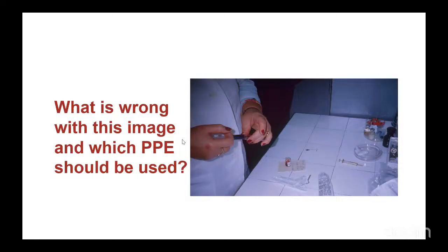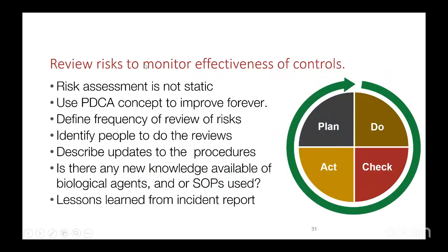Okay. The needle was not capped. Okay. The sample was not covered. Spillage can occur. Yes. So these are many more of what is actually wrong, and which PPE should be used here. Talk about the hand gloves. Okay, moving to the next.